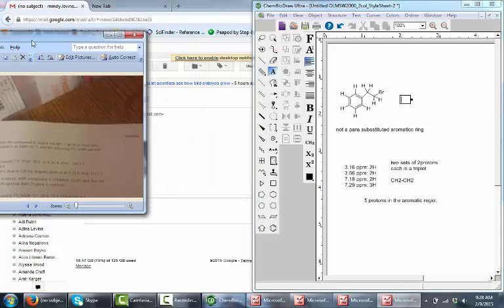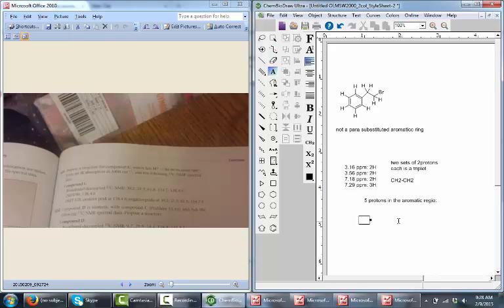Okay, we're going to do question 13.61 now, so I show that here. I hope it's clear enough. We're trying to figure out the structure for compound C. Okay, the mass that we have is 86 in its mass spectrum. We have an IR at 3400 wave numbers, and this carbon-13 NMR data. Okay, so the first thing we're going to figure out from the IR spectrum is that we're talking about an alcohol. Okay, so this is now 13.61. This molecule has a mass of 86 AMU and an alcohol.